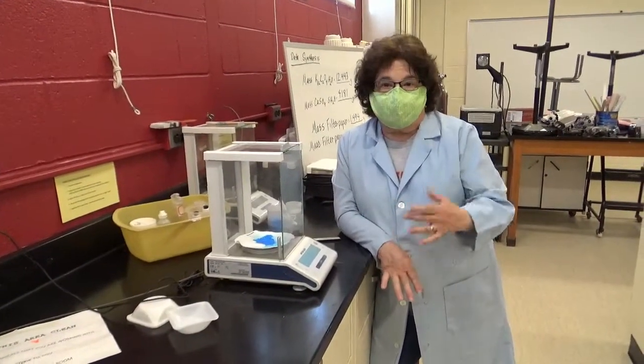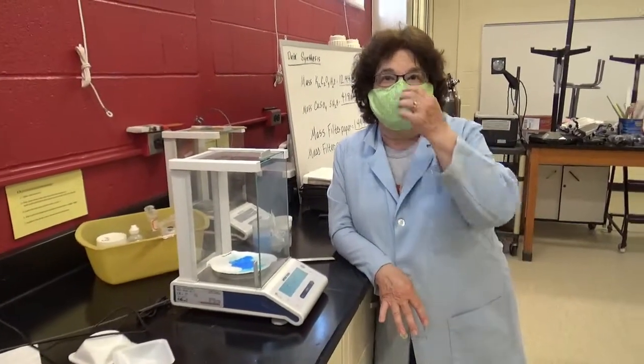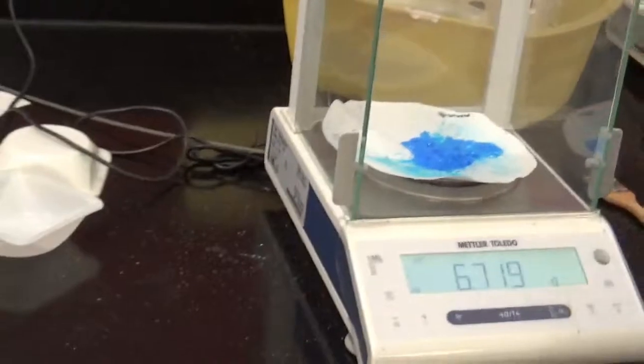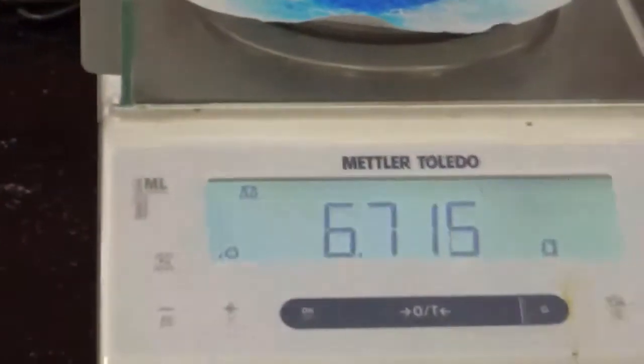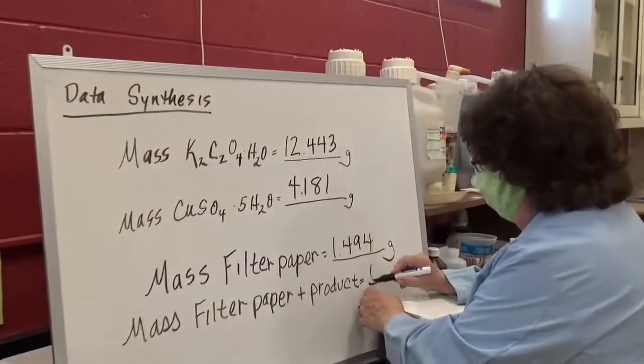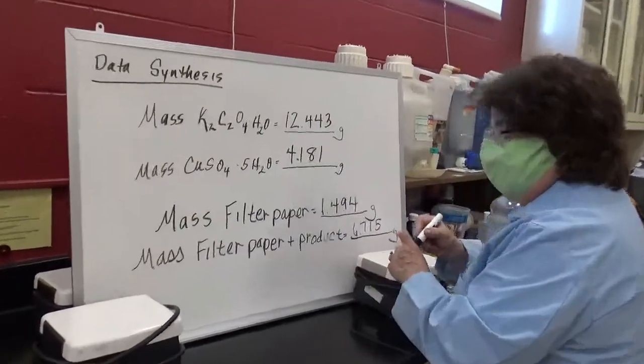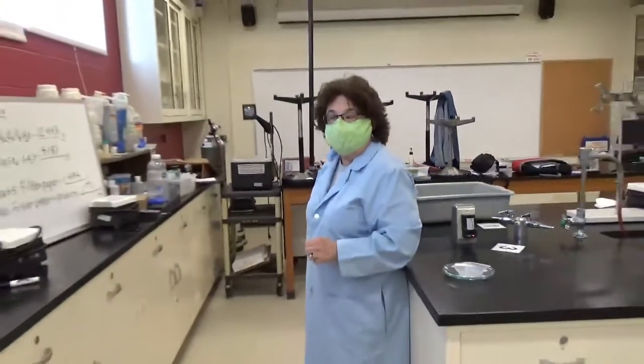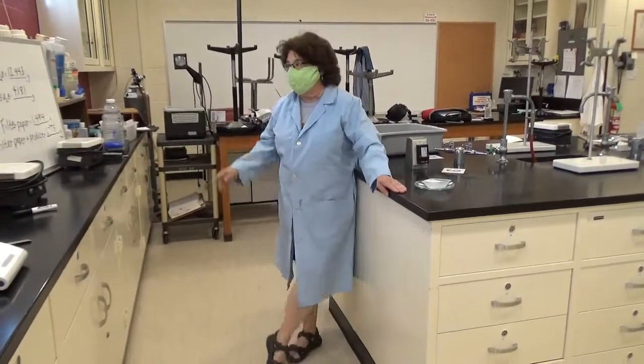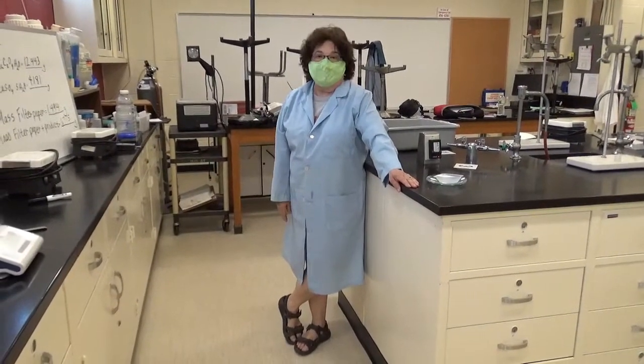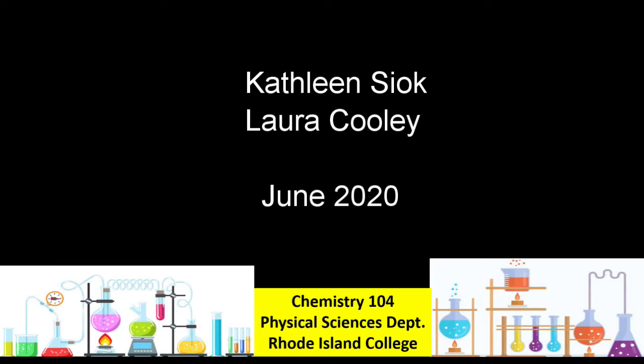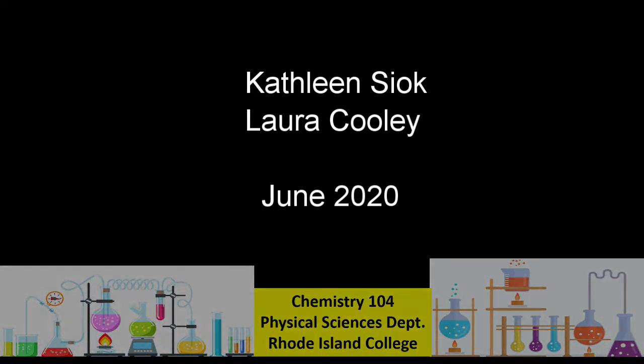So here we are. We took our material, we filtered it, put it in the drawer and let it dry. And it dried by itself. This is the next lab period. And we took the filter paper, which had been empty, and we actually get a total mass of 6.715 grams. I'm going to write that down. So that kind of completes our data for the synthesis of this unknown compound. We know how much we made. We know what we mixed together. And we're going to be working on knowing which one of these is a limiting reagent, if either one is. And then we're going to be figuring out the percent yield that we got from this synthesis.